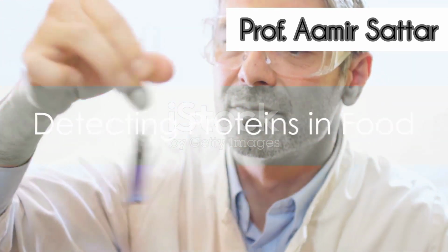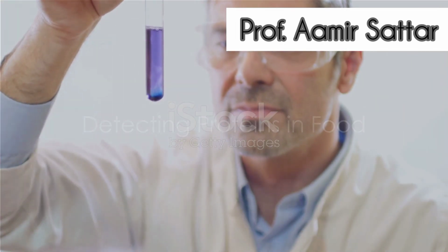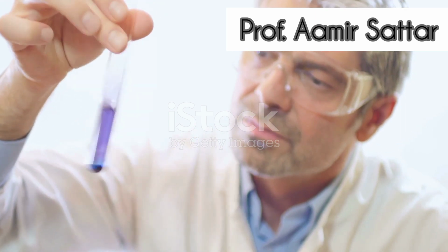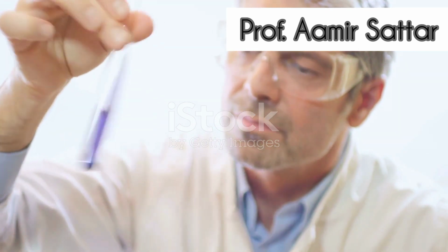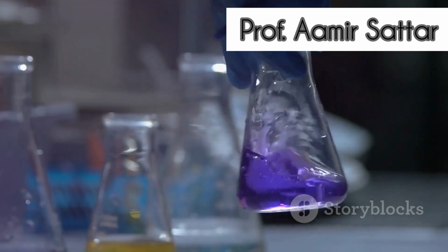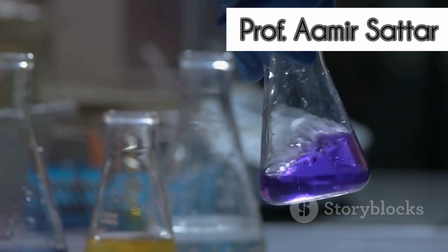Moving on to proteins, these are the building blocks of life, vital for various bodily functions. To detect proteins, the Biuret test is commonly used. Here, aqueous copper sulfate is added to the food sample. A violet coloration confirms the presence of proteins.